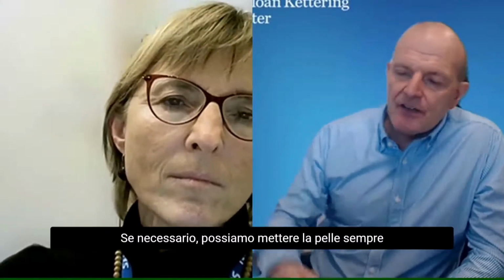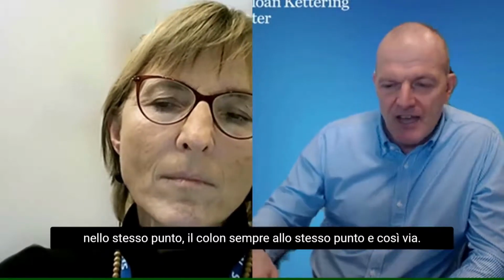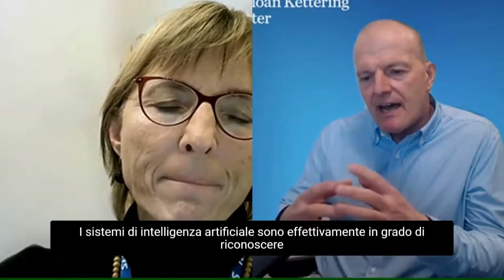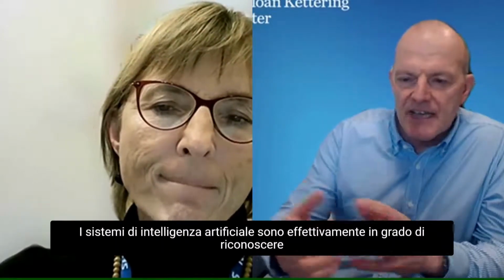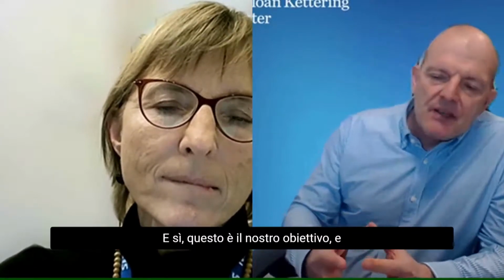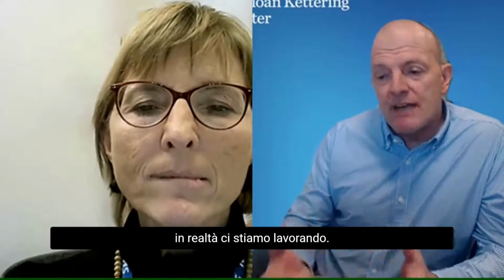If necessary, we can place the skin always in the same spot, the colon and so on. But according to the people that we talked to from AI, that's not even necessary. AI systems are actually able to recognize what tissue is in which place. And yes, that's our aim, and we're actually working on it.